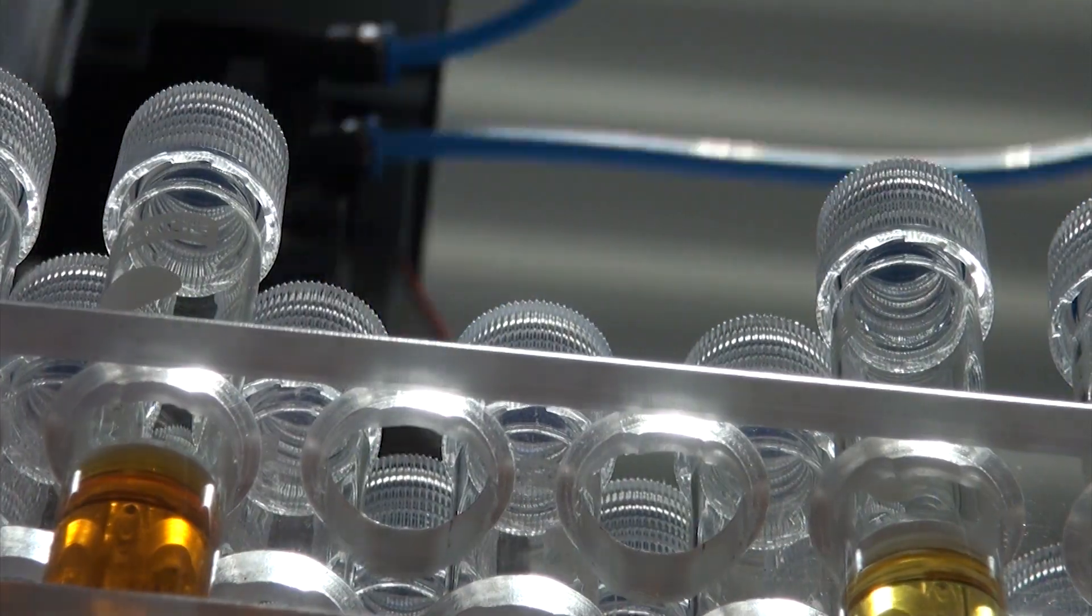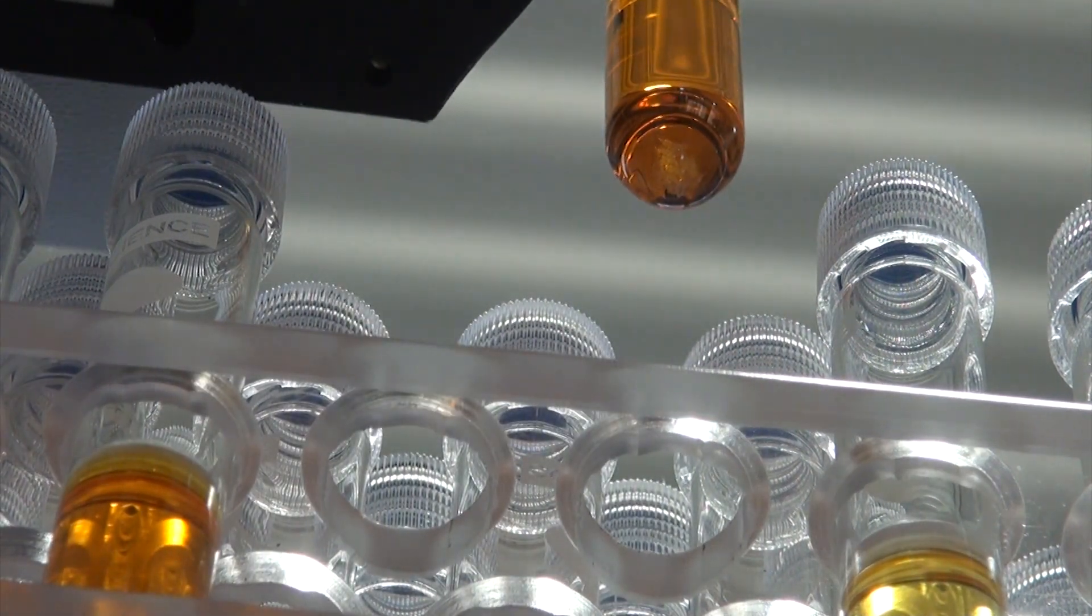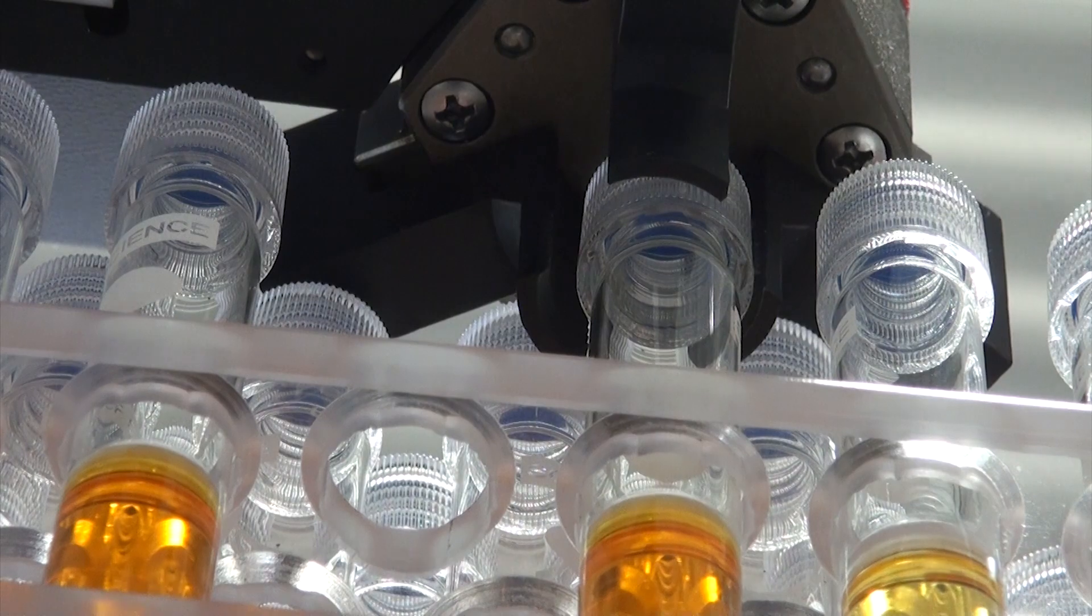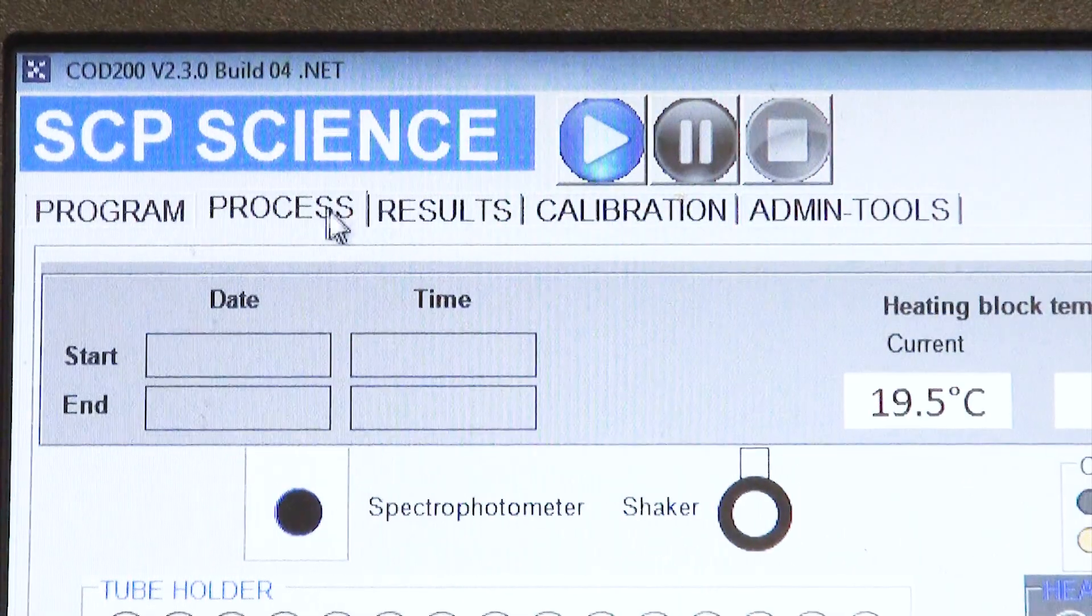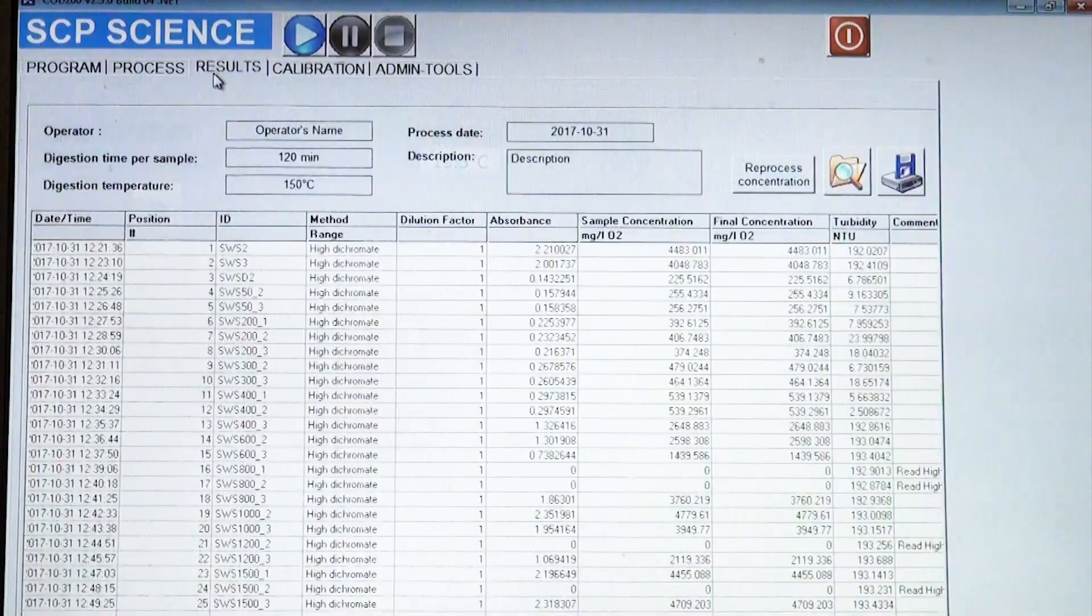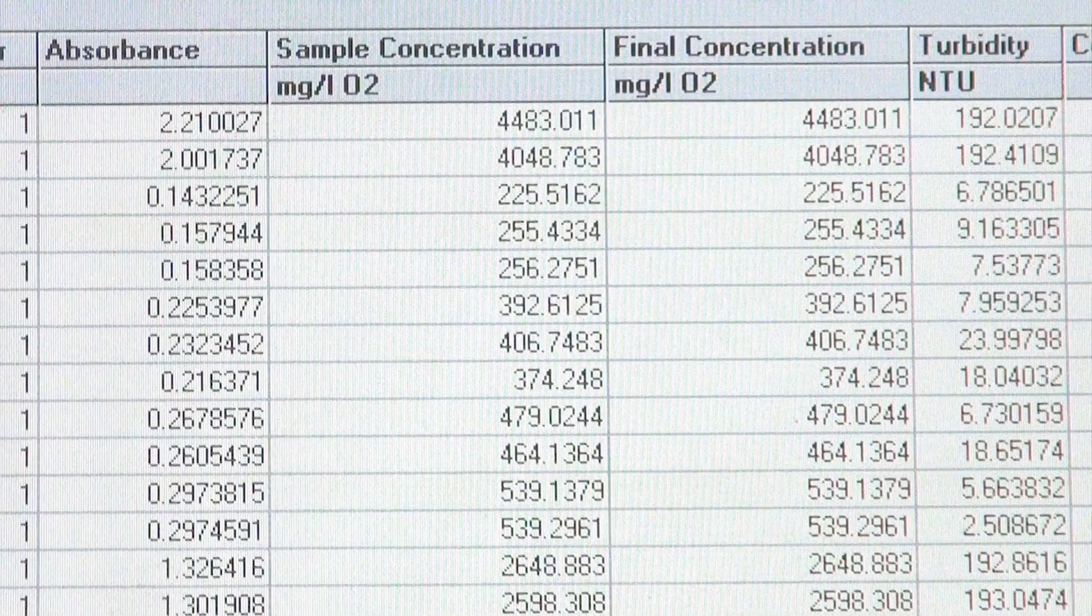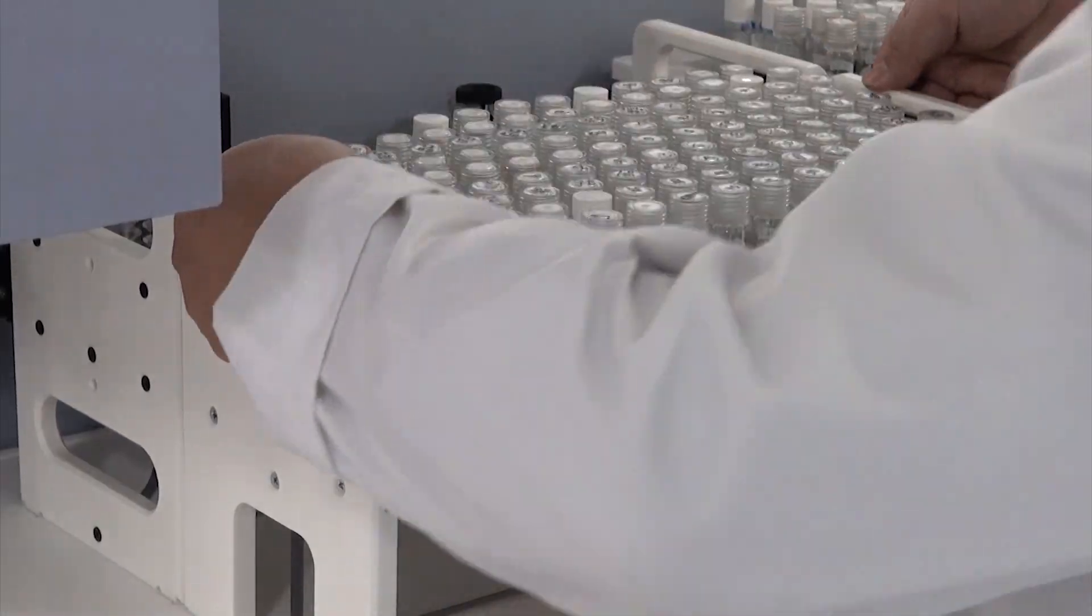All metal parts on the COD 200 are Teflon coated. The anodized frame and the exterior skins are corrosion resistant. Real-time software visualization of the run allows the user to easily track progress and results. Racks are easily moved on the system's platform.